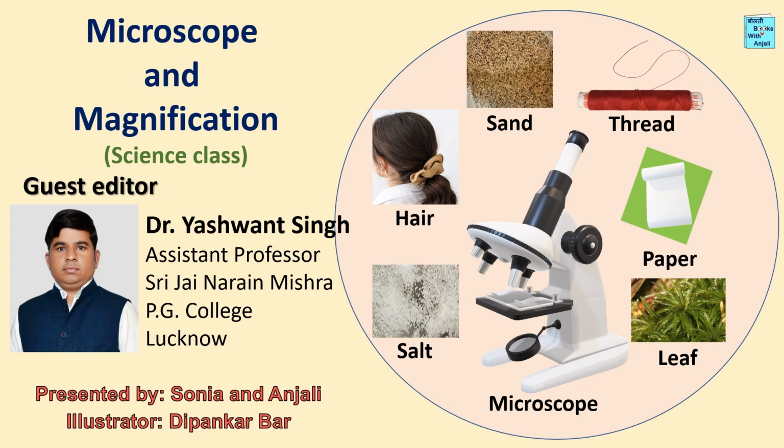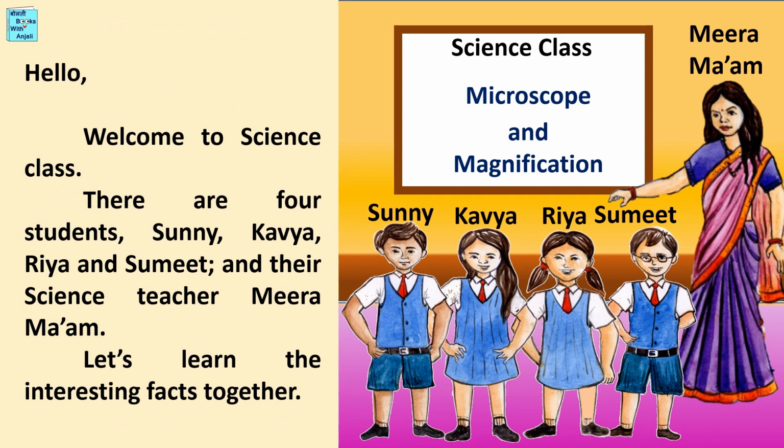Today in science class, we will learn about magnification and see the things around us through a microscope. Dr. Yashwant Singh, Assistant Professor, Shri Jai Narayan Mishra, PG College, Lucknow, is joining us as guest editor. Welcome, sir. There are 4 students, Sunny, Kavya, Riya and Sumit, and their science teacher, Meera ma'am. Let's learn the interesting facts together.